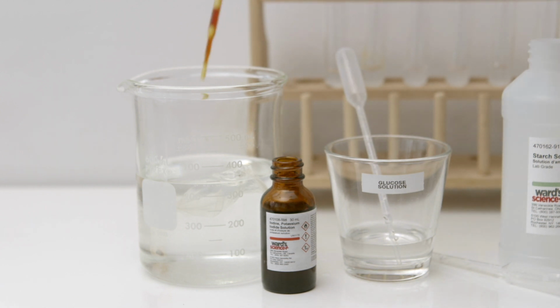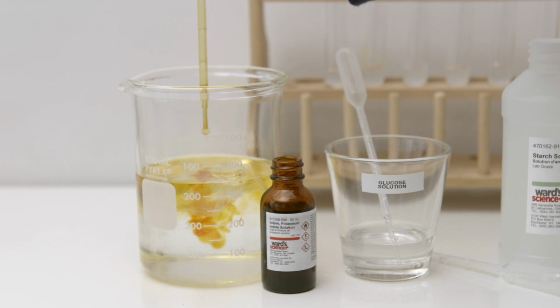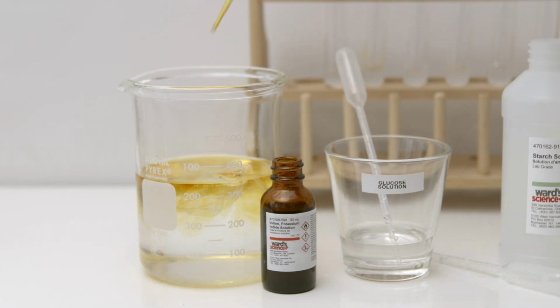Lugol's iodine is a starch indicator solution. It is amber in color and turns to a blue-black if starch is present.